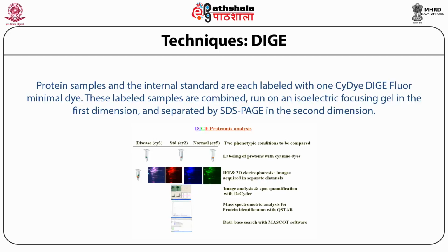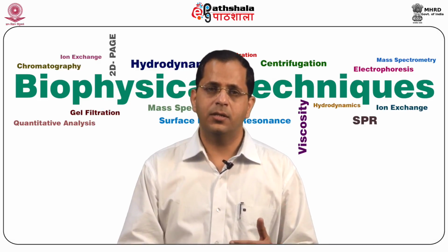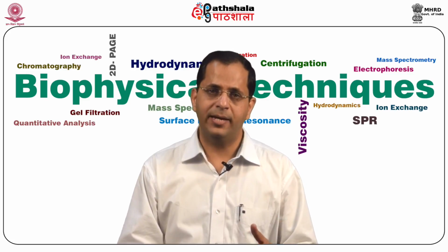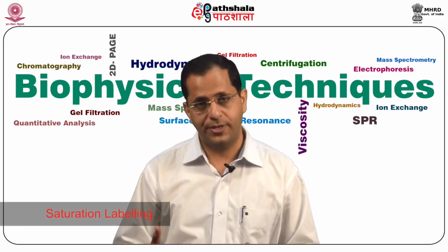The data generated on the mass spec machine is now used to match the theoretical mass to charge data that is available on the net, and the proteins are now identified. We have now understood the application of minimal labeling in the DIGE technique. Let's go on to understand saturation labeling.